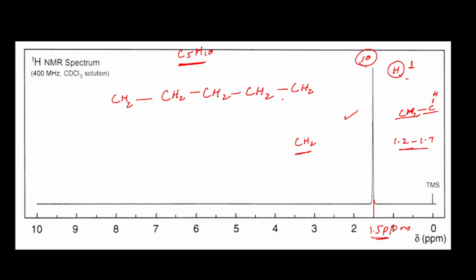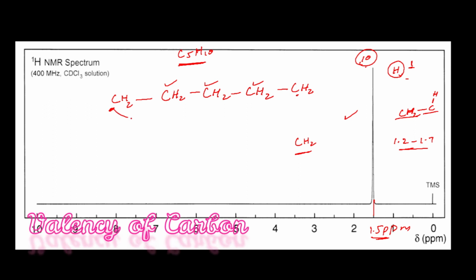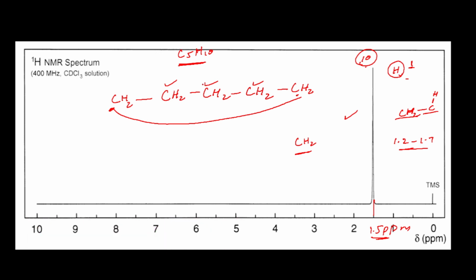Okay, now if you see here, this CH2 group is present, this is fully satisfied, and this is fully satisfied. But this carbon and this carbon are not fully satisfied according to their valency. So what you will do is join these also. Then is it correct now? If the valencies of these carbon atoms are now correct, is it so? Yes, this is correct. So your structure is simply cyclopentane. This is your elucidated structure. So the structure that you elucidate is cyclopentane.